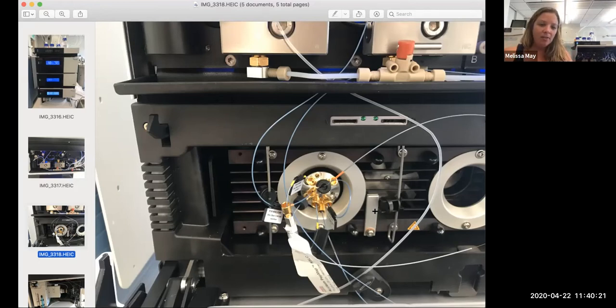When the valve is in the 1-2 position, buffer comes down from the loading pump, and basically things are flowing this way through that valve series, okay? So this comes from the loading pump into 3, it goes into 4, flows into the column, goes into the mass spec. The one that's coming from the autosampler is basically just gonna go straight to waste, and this trap column, nothing's flowing into it, okay? Because of the way things are positioned.